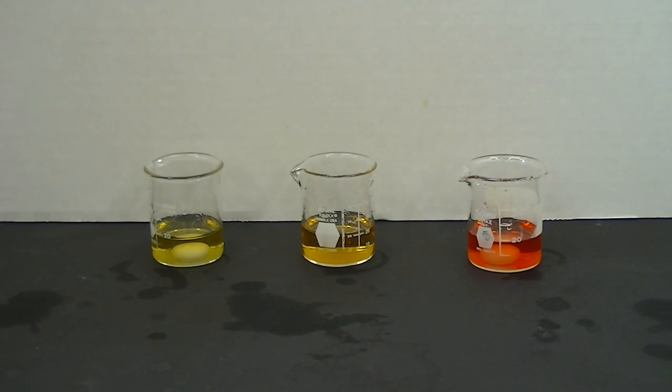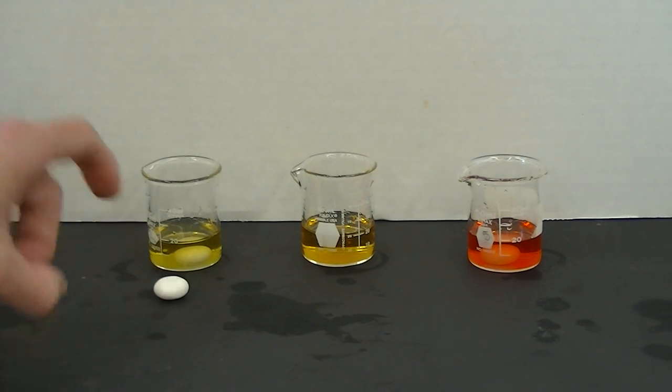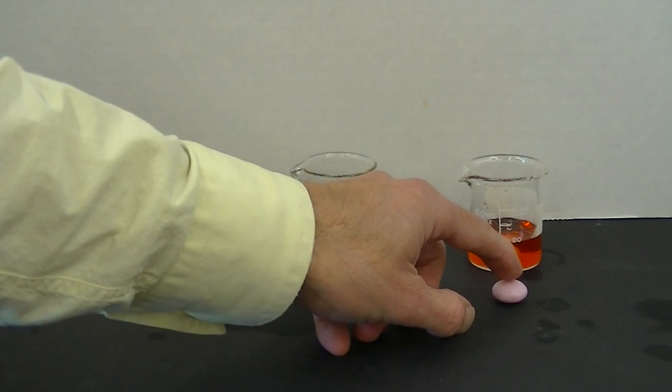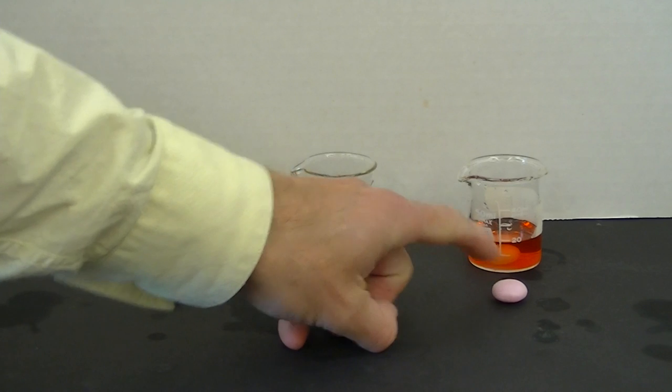Well how can that be? They're both white Mentos candies. Well here's the trick. In this beaker is placed a white mint Mentos candy and in this beaker is placed a pink strawberry Mentos candy, but you'll notice it wasn't pink when I placed it in there, it was actually white.